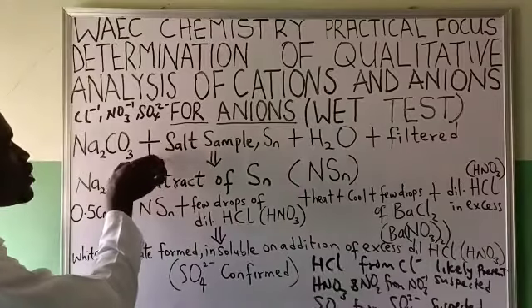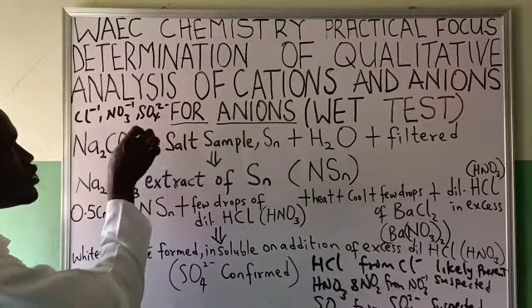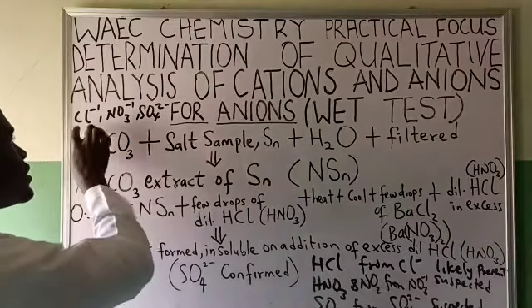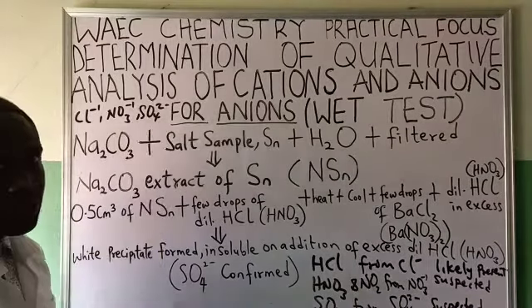Why are we preparing sodium carbonate extract of that salt sample? For us to test these acidic radicals or these polyatomic anions.